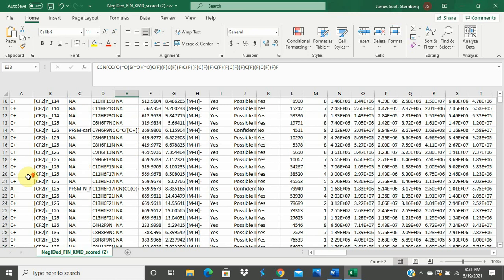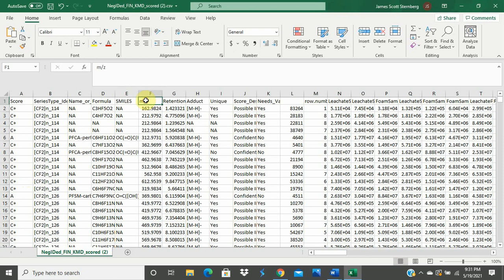The mass charge column is very helpful. Sometimes, if there is no formula, you can still infer a candidate formula if it is a member of a series with a suggested formula and the mass falls into the series intervals of 50 Daltons apart. For example, if you have a mass that falls within a series and no formula, take a look at the formula before it.